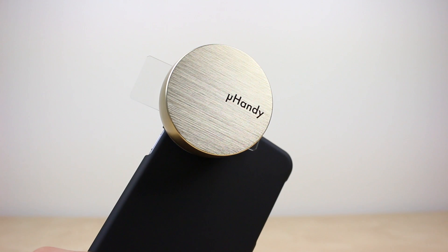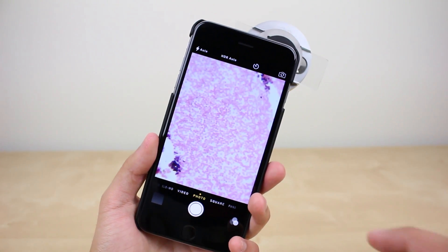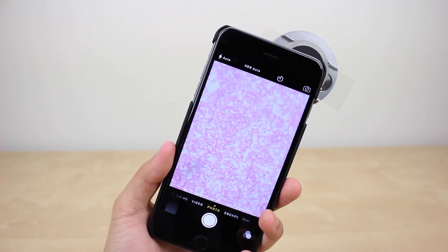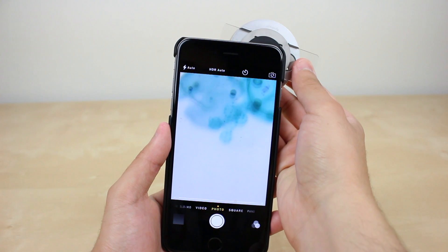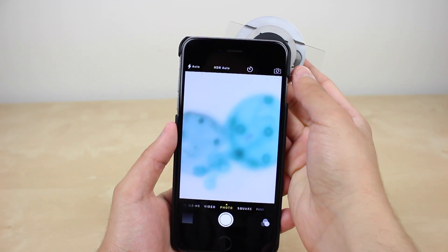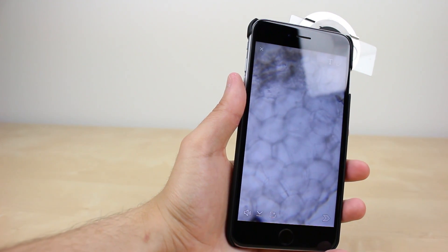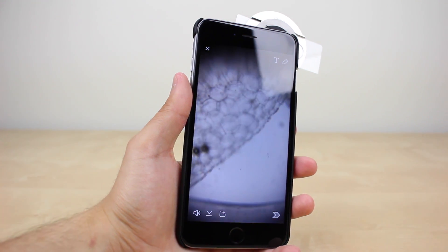Overall I think this is a great device if you're into microscopy. It doesn't match the quality of a professional microscope, but it is good enough for its size and portability. I do wish they included a separate carrying pouch instead of having to use the box when transporting it. But other than that, it is a very solid device that works as intended, and I really like how easy it is to share my findings — I've freaked out some friends on Snapchat, shared some pictures on Twitter, and was even able to do a mini showcase on Periscope.